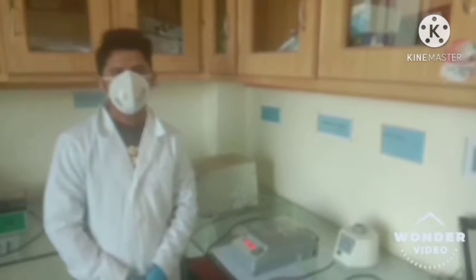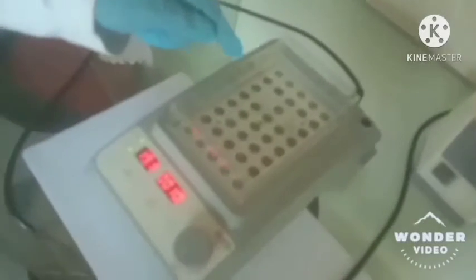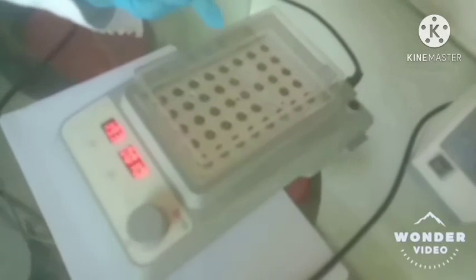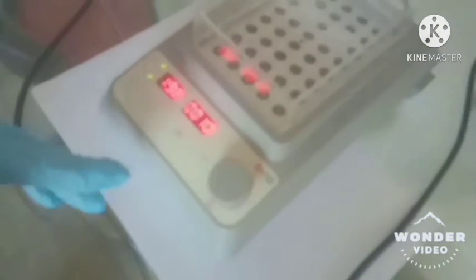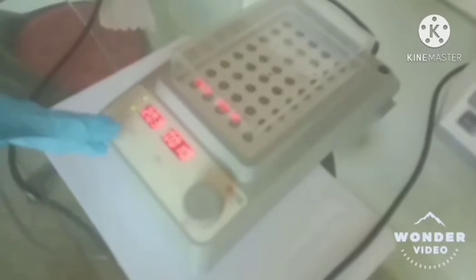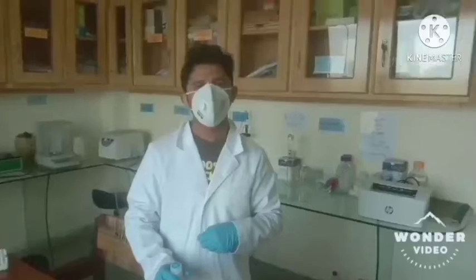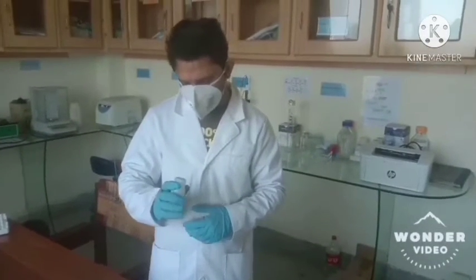The first section is the lysis step. We have added 200 microliters of the blood, 200 microliters of the digestion buffer, and 20 microliters of proteinase K, and we will place it in the D-Lab D3024 instrument for 10 minutes at 56 degrees centigrade.